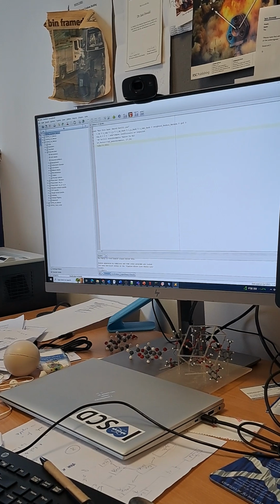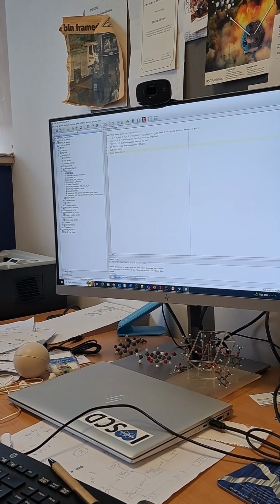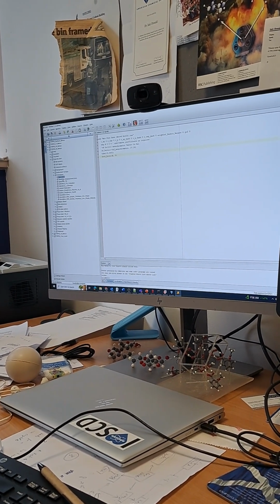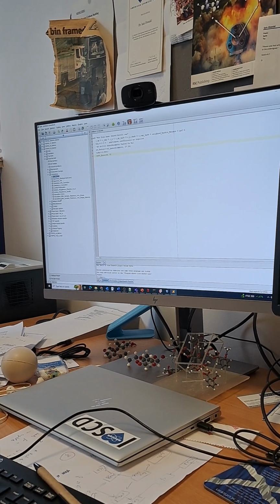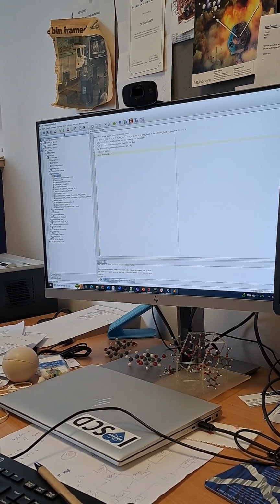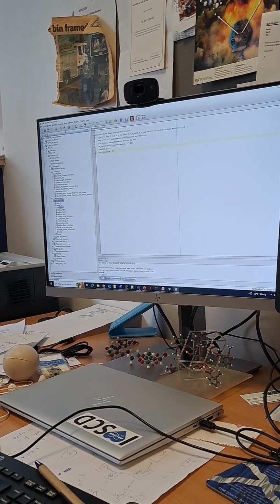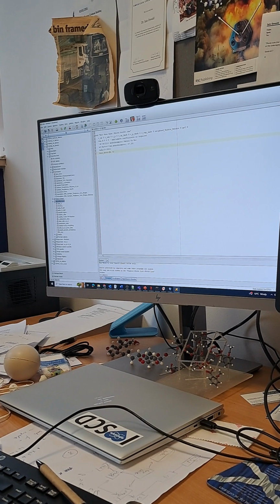Then what we can do is look for corrections. We could look for a 0 error. If your flat plate is not quite flat, it's okay. Anything else, not really bothered about. Mixture details, not really bothered about. Miscellaneous, we could start and end chopping depending on how things go, but we'll just leave it as it is.